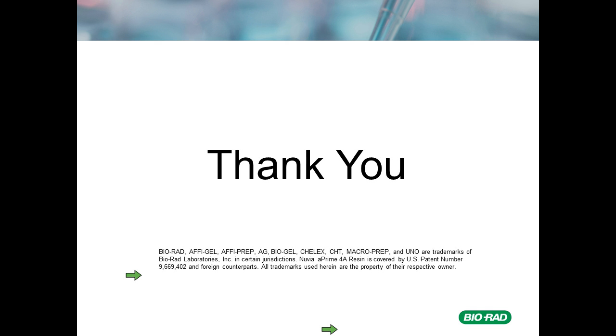Okay. And what are the pros and cons of using ion exchanger versus CHT for vaccine purification? So that's a great question, and it's kind of a long answer. So a priori, it's better to use ion exchange as the first step almost in any process, with the exception of perhaps monoclonals, because they tend to be much more robust and they tend to survive harsh cleaning better than some other resins.